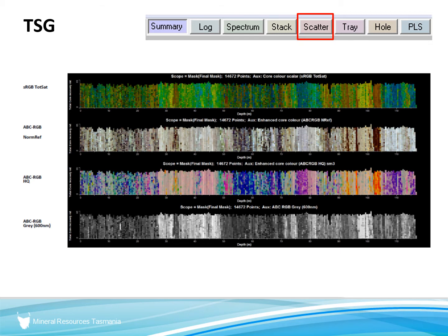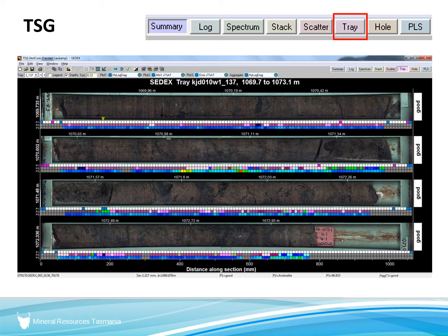In a tray screen, we can see not only just an image of the tray, but we can put different measures of, say, mineralogy. So the middle plot here, the color is the mineralogy. And I can see down here where the green bits are, that's where there's a little bit of chlorite perhaps. And here you can see there's a little color normally associated with that. So we can tailor the screen however you like.